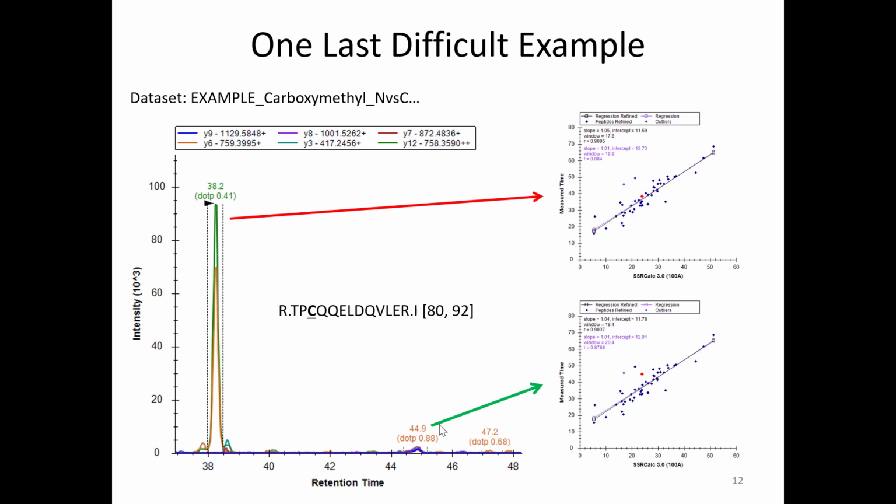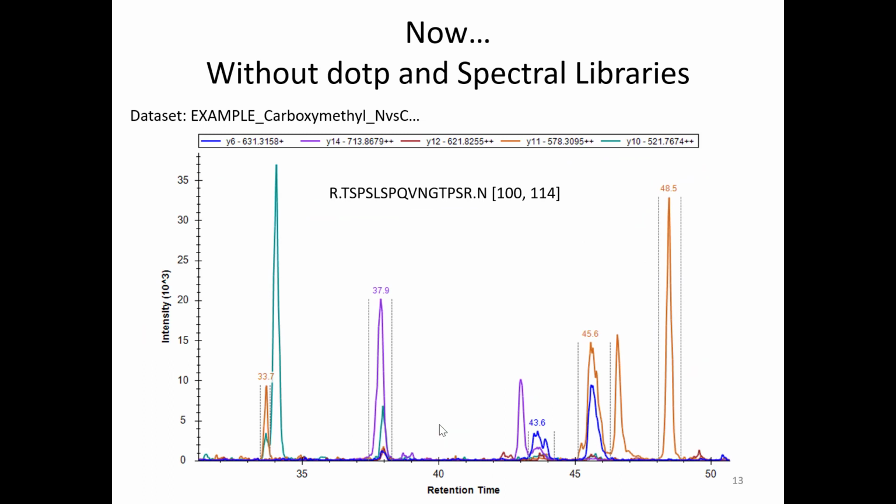But it's hard with large data sets and low signal to noise stuff. It is challenging. But if it was easy, everybody would be doing it, right?